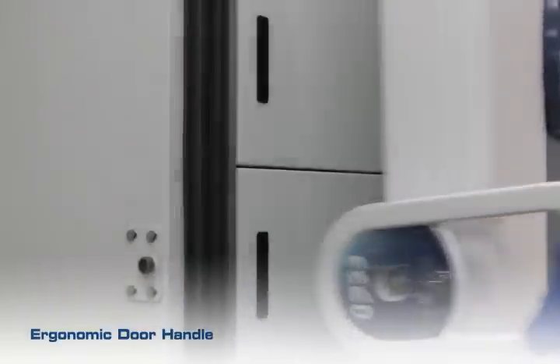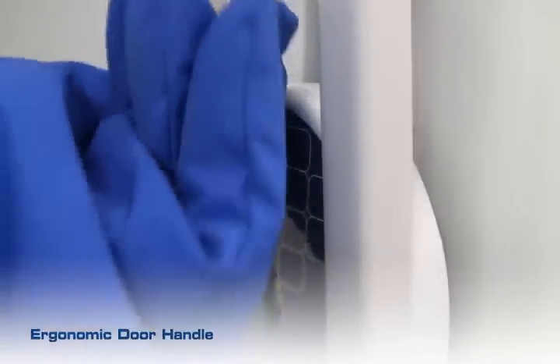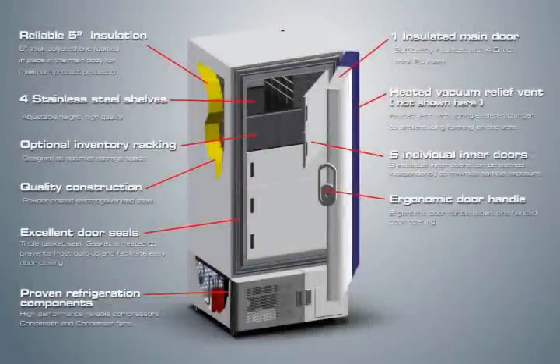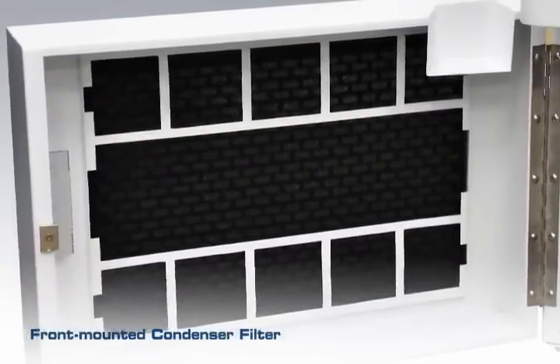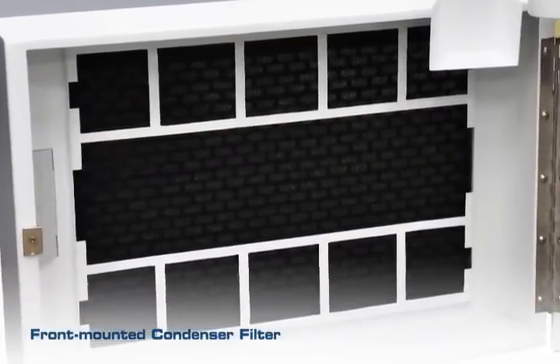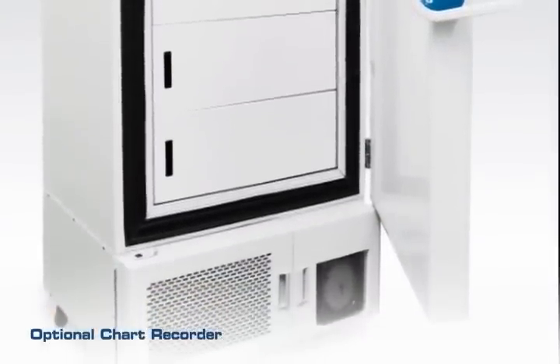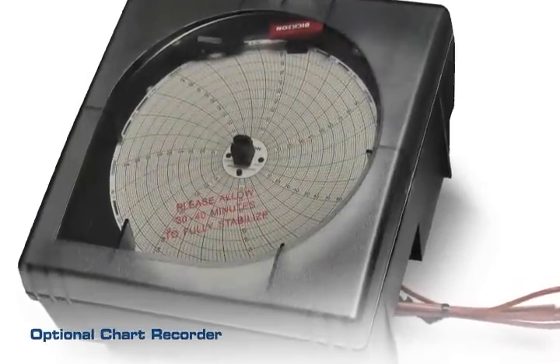An ergonomic door handle allows one-handed door opening. Key locks are provided with every unit to prevent unauthorized access. A washable filter is front-mounted for easy access without tools. An optional chart recorder is available for independent temperature monitoring, which is factory prepared for field installation.